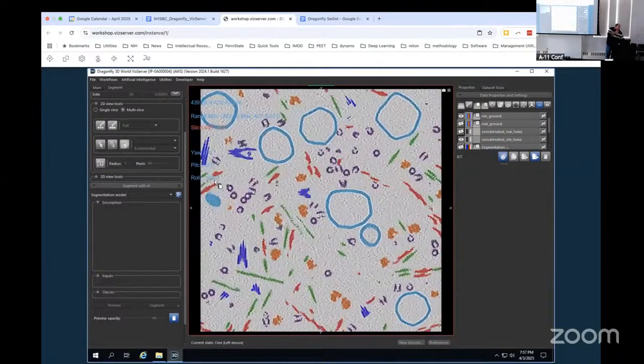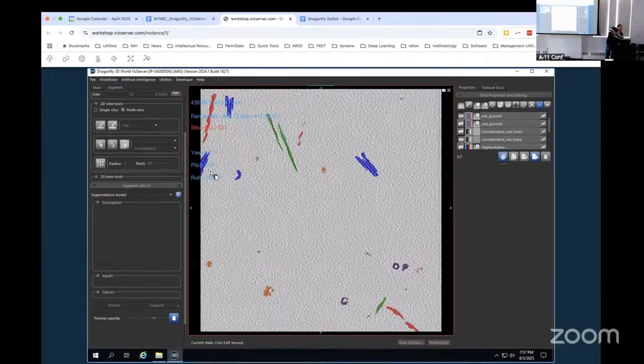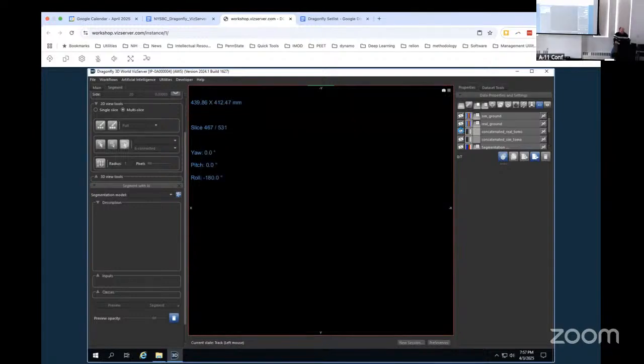And we have the ground truth. I even put some fiducial markers in here. You can see them. These are simulated gold fiducials that you can add in CTS. I forgot to mention that. But I'm telling it to ignore them. Now, did that work? You know, kind of. We still had to put some real data in to distract it.